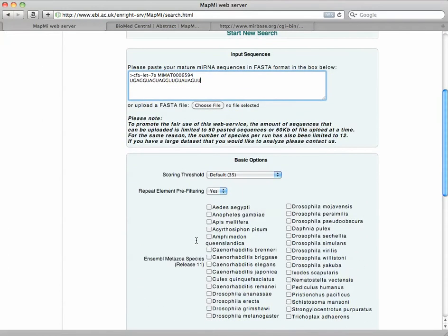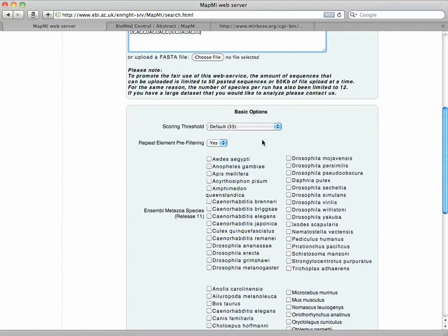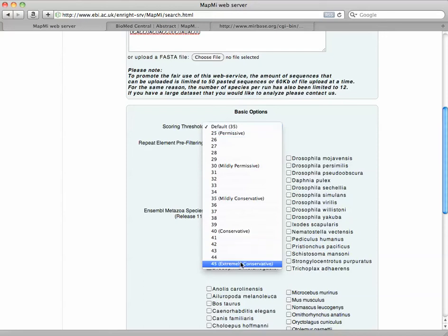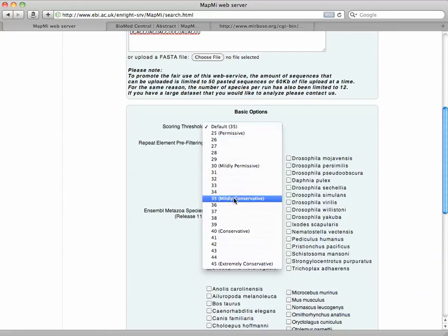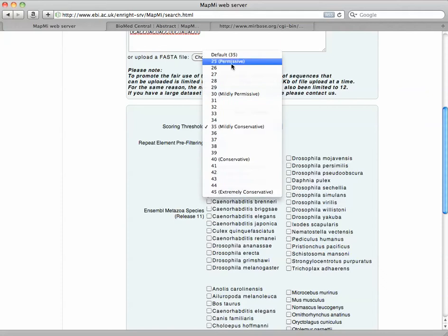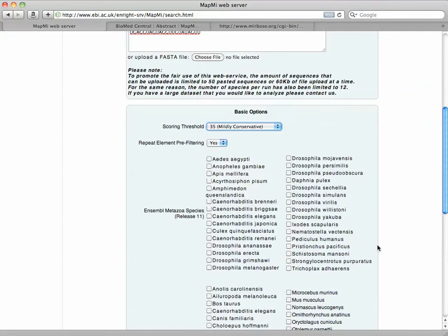Go back to the server and paste this in. Now I have my threshold. Permissive is 25, extremely conservative is 45. We're going to do the 35, which is the default they put it on.